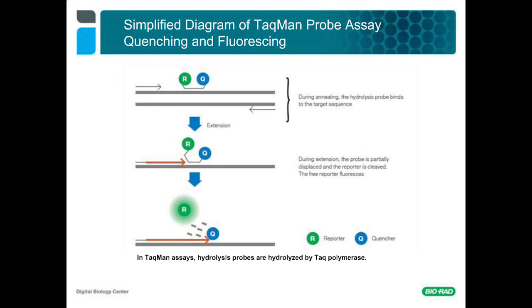The fluorophore is shown as a reporter in the above example. Taq DNA polymerase is also very thermostable and has a large range of temperatures that it can both tolerate as well as perform polymerization of new DNA. This is necessary since high temperatures are needed to melt double-stranded DNA after each round of polymerization.